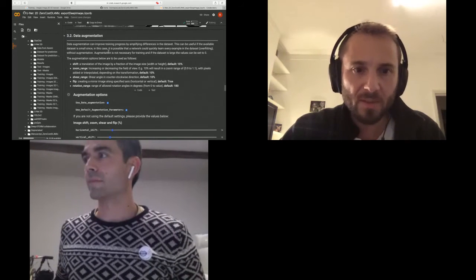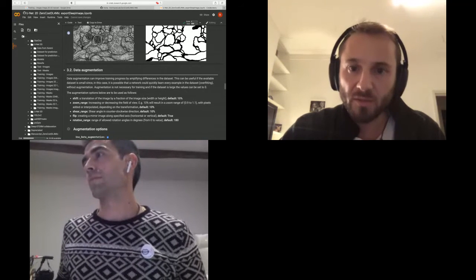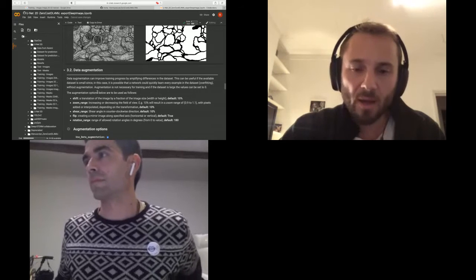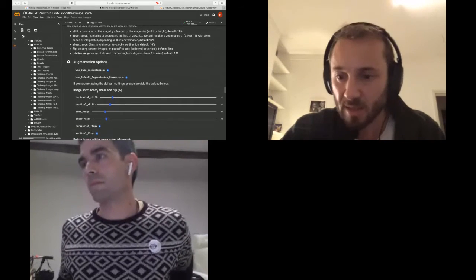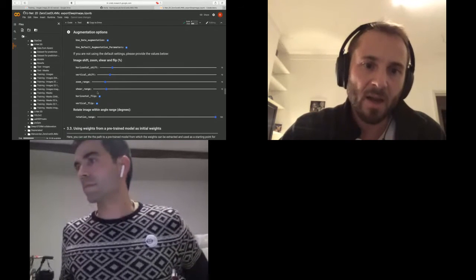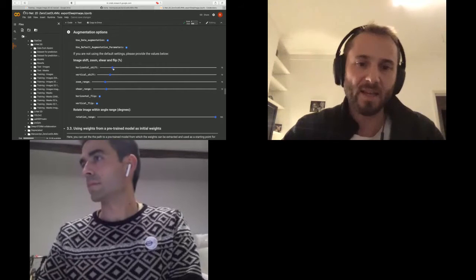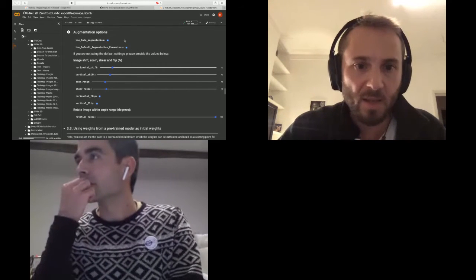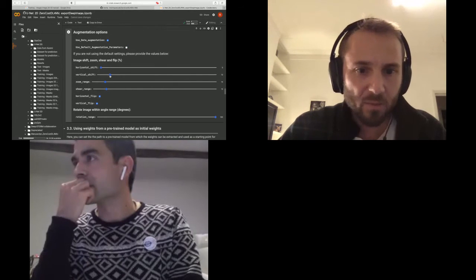We've got the capability of doing data augmentation, which is a way to transform the input and output data in ways that are sensible for the data set that we are dealing with, and that increases the richness and the complexity of the data set. So I'll be using data augmentation today, but I'll be tweaking it a little bit.